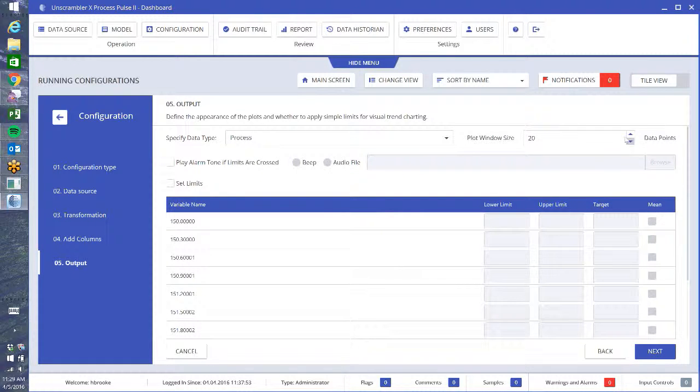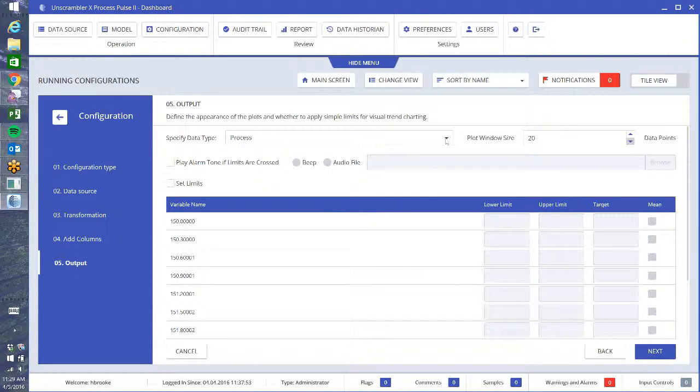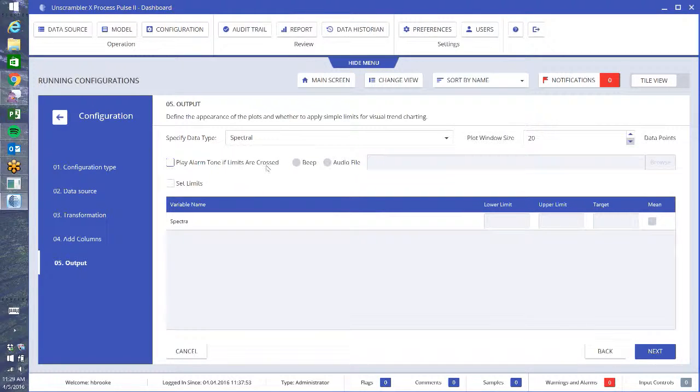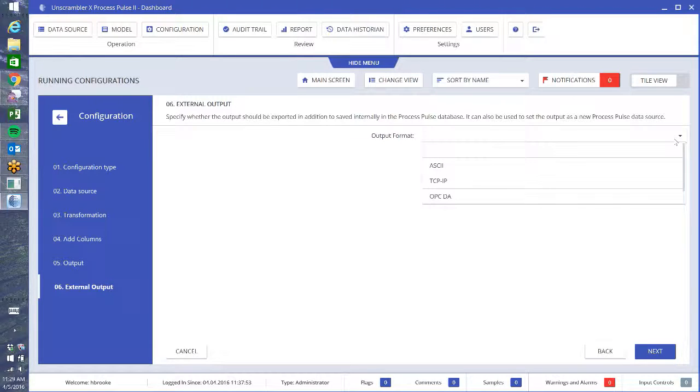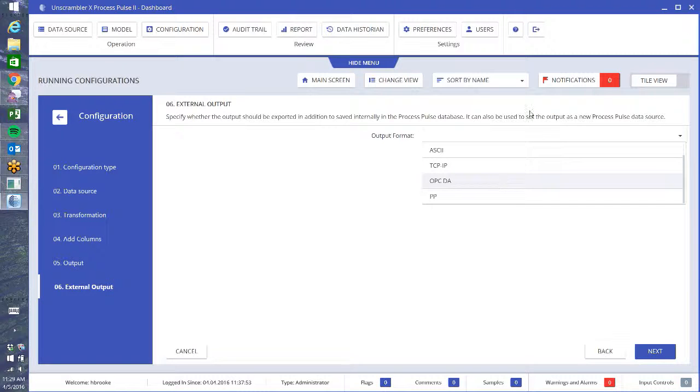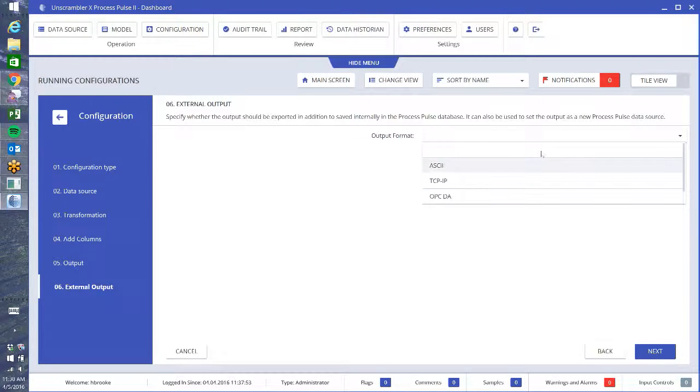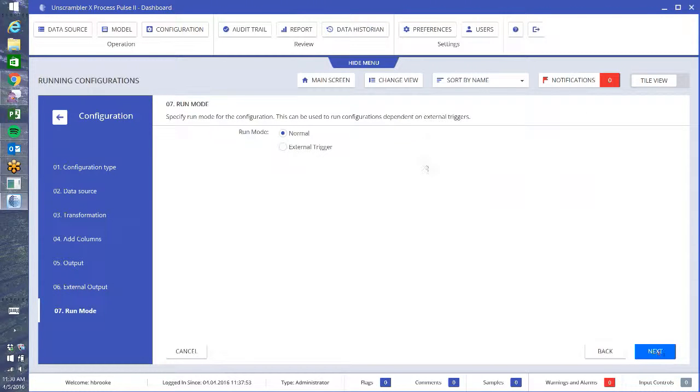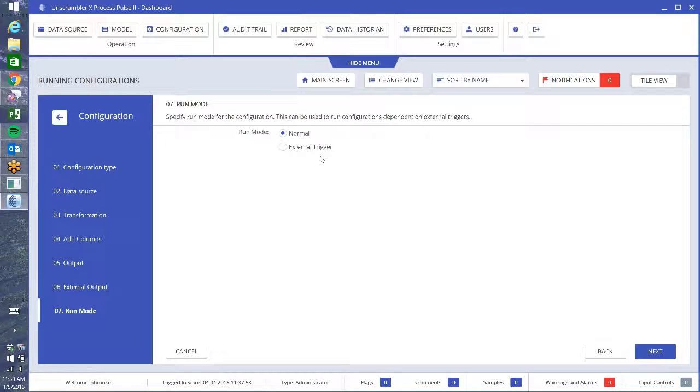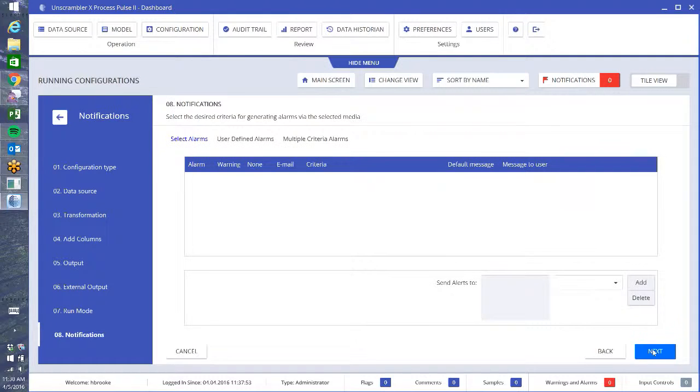I want to specify what kind of data is it. It defaults to process data, but I know that this is spectroscopic data, so I want to change it to spectral data. It makes a little bit of difference of how it saves things and displays things. Going to say next. There's other output formats if you want to export things in OPC or TCV IP, ASCII. I believe this is Process Pulse as well. I'm just going to leave that blank for now because it will store within Process Pulse as well. Next, I'm going to run normal. You can also have an external trigger if you're connected with the TCV IP directly to an instrument, that would be that your instrument is causing the trigger to run the model. I'm just going to say next. In normal, it just waits for new data to show up in that watch folder.